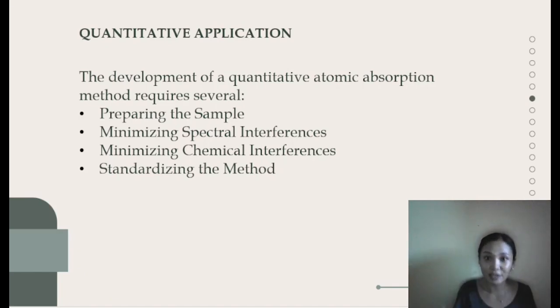If we are keen to the composition of our sample's matrix, then we are able to adjust the atomization of our samples. We can adjust the atomization process by increasing or decreasing the temperature to eliminate interferences. And third, we can minimize spectral interferences if we use flame atomization, especially when increasing the temperature, because it avoids the production of other molecular species such as oxides and hydroxides.